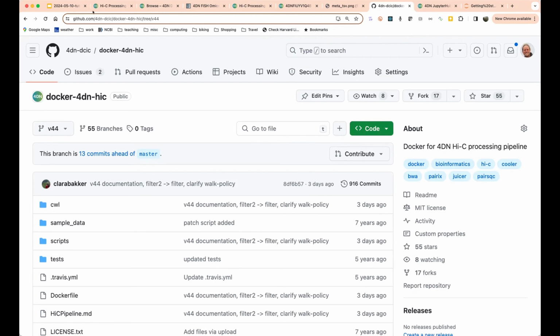And so not only Hi-C, but we've taken the RNA-seq, ATAC-seq, ChIP-seq pipelines from the ENCODE project and adapted them and run them, so essentially the data should be analogous and comparable between ENCODE data sets for those types of analysis pipelines. We don't have any single cell pipelines implemented, but generally we take the analysis results from the labs in those cases.